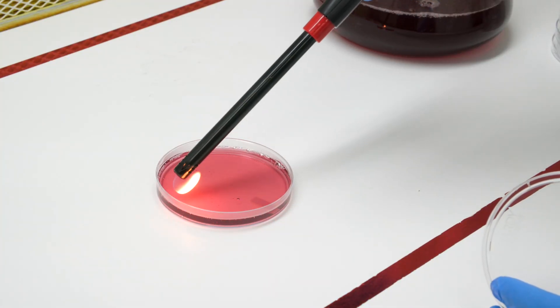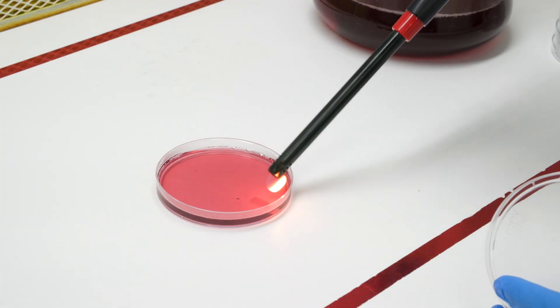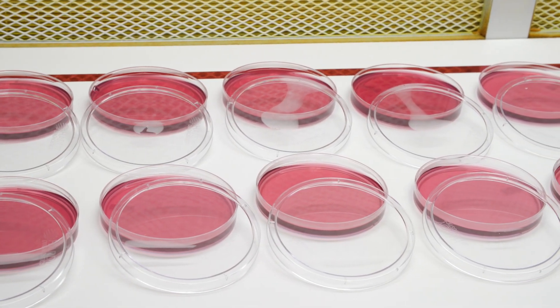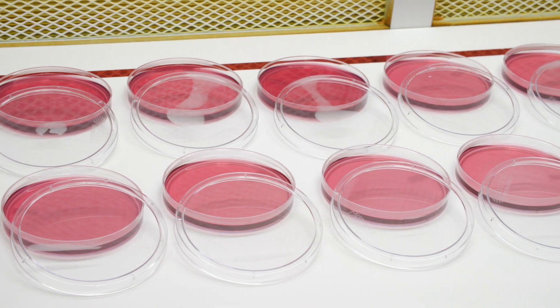If bubbles do occur, they can be popped with a flame from a lighter. Allow the plates to cool so that the agar will set up solid. This should take no more than one hour.